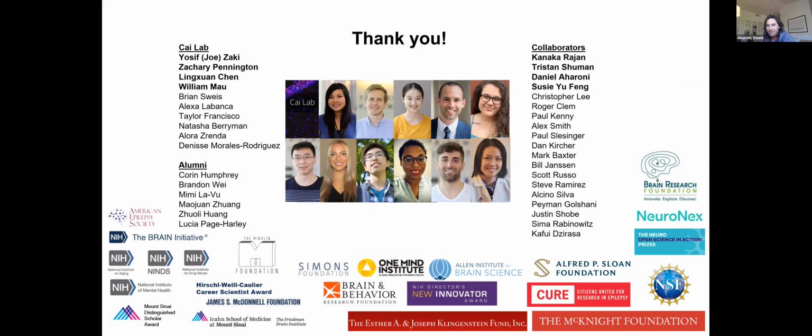Cool. Okay, we have more questions, so we have a few minutes, so let's try to hammer these ones out as well. Does this pipeline work well for both version 3 and version 4 Miniscope data? And do you have any advice for dealing with optical artifacts like dark spots from dust on the image sensor and things like that? For version 3 and version 4, I don't think there is anything that needs to be modified. The only difference is the different size of field of view. I think the cells in version 4 tend to be smaller than version 3, so you want to change some parameters to account for that. That's the only thing I can think of. But that's what the visualization is designed to do.